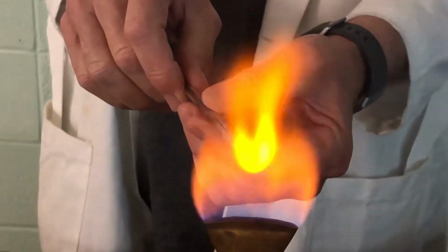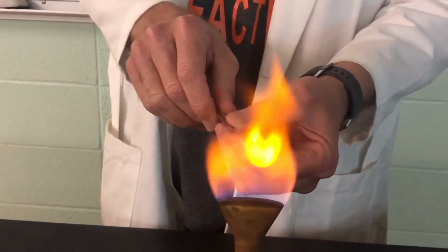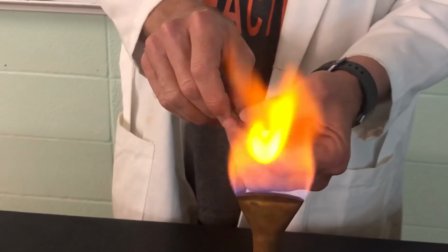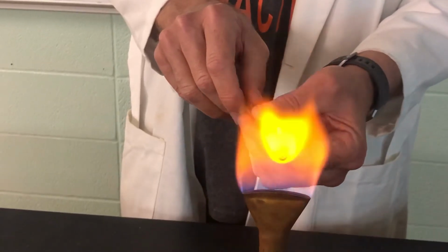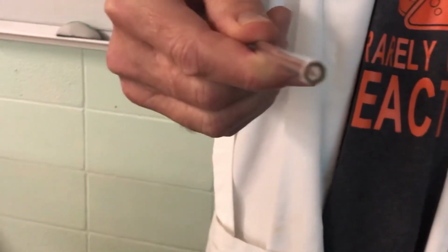Go a little bit longer. I'm trying to keep it right above the inner blue flame. That's the hottest part of the flame. With all the additives in here, it's kind of hard to see. Yeah, that's rounded very nicely there.